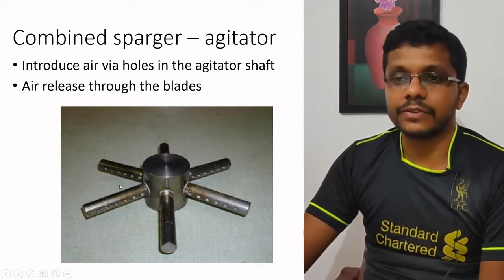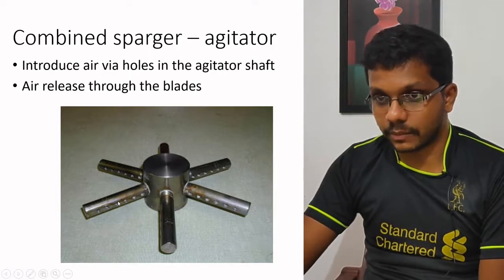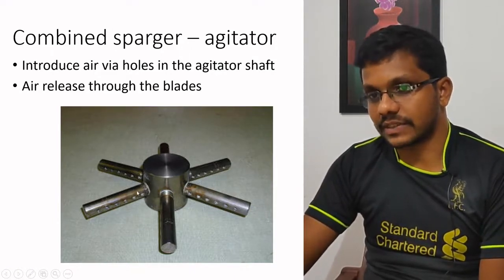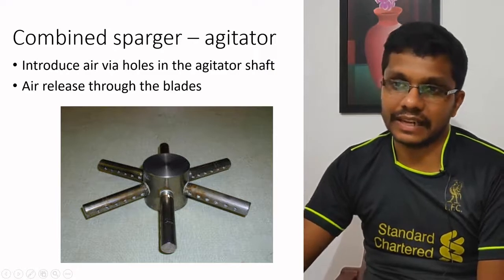And sometimes we use a sparger agitator combination just like this. This is an agitator, and here you can see some holes, and when it is working you can see the air bubbles coming out from the impeller portions. So it is a combined aeration agitation system.